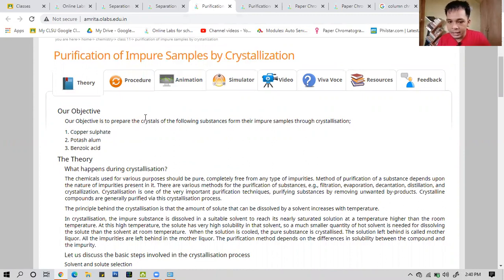So ano bang mangyayari? Bakit natin kailangan ng crystallization? Sa copper sulfate kasi, kapag kinuha nyo siya sa reagent bottle, makikita nyo doon sa label ng reagent bottle, which wala akong mapapakitang demo kasi wala ako sa laboratory, is makikita ninyo yung classifications niya. May makikita yung mga impurities doon such as aluminum and other trace metal, which implies that the copper sulfate is not 100% pure. So, paano nyo siya isi-separate or to improve its purity? Gagamit kayo ng crystallization, guys.